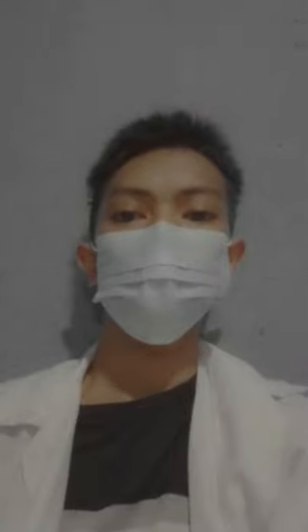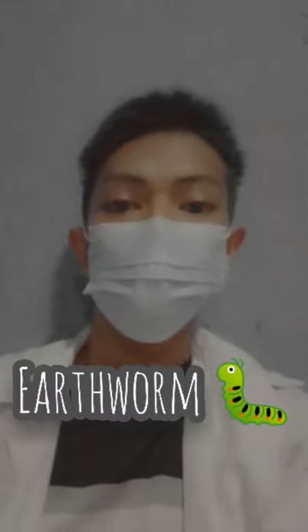So today is Friday, November 6th, 2020, and in this video I'm going to show you how to dissect an earthworm. And before that, I'm going to show you also the things that you're going to remember or prepare before doing such an operation.